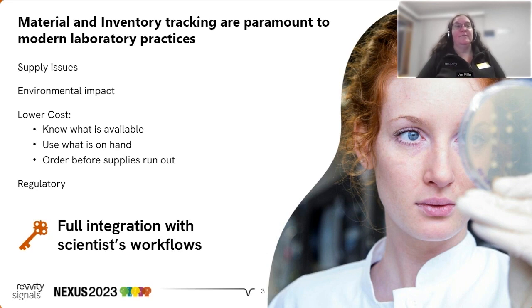With all of these important factors, there is one more that we are all acutely aware of, and that is safety. Safety in interacting with and disposing properly of spent materials. This is key to keeping our health and environment safe. With the Signals solution, we help keep track of important safety information, and we display that information to the scientist in the experiment so that they can be aware without having to search for information in yet another solution.